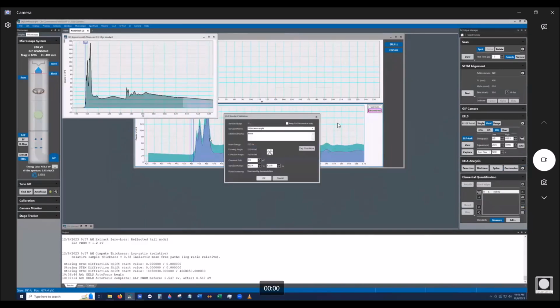Okay, so then we have to specify the range. So now this is the oxygen K edge right here. We don't want that in there. So basically what I'm going to do, I'm going to call this anatase, TiO2. I put a whole bunch of crap in there.